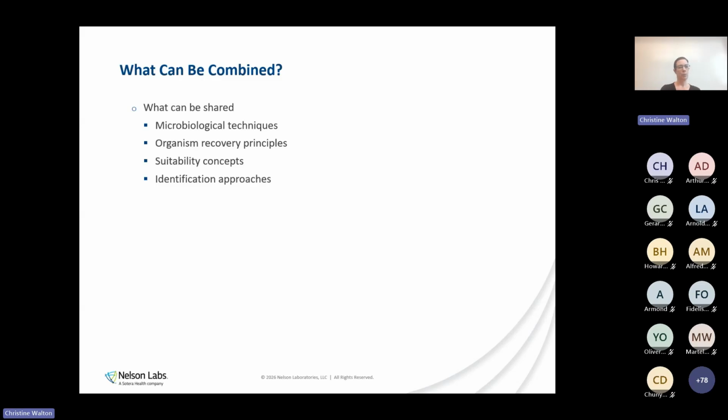We're in an awesome realm right now where we're getting into rapid methodologies, which are really opening up the world for microbiology, moving away from CFU into different unit qualifications. These are techniques that are well established, some up and coming with rapid methodologies, but that doesn't mean that these techniques can't be shared. So these methodologies, whether I'm following an ISO pathway or a USP or an EP, these pathways or these principles should be able to be shared and straightforward between them.